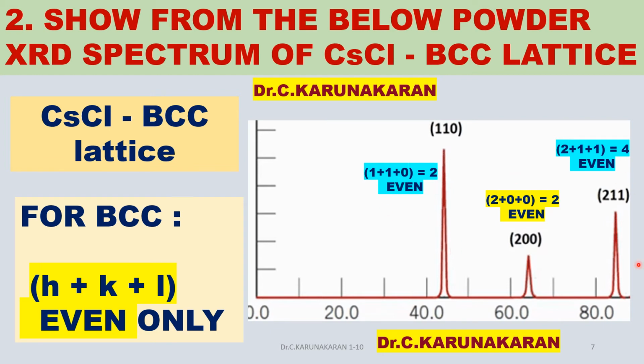There are several lines observed. I have shown here only selected lines for you to understand. The planes are labeled from the angle of incidence theta using the equation we have described earlier.